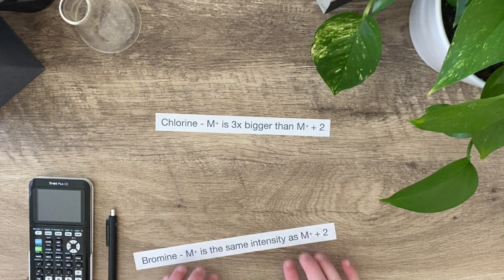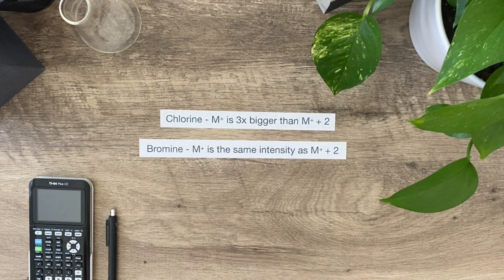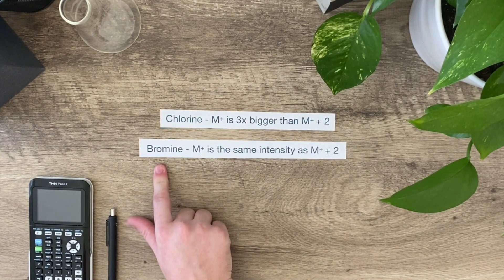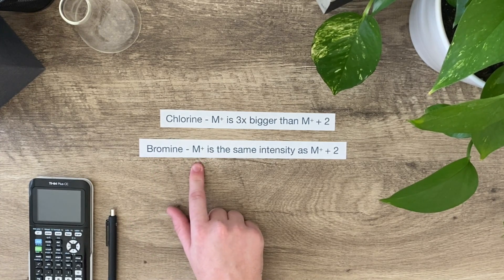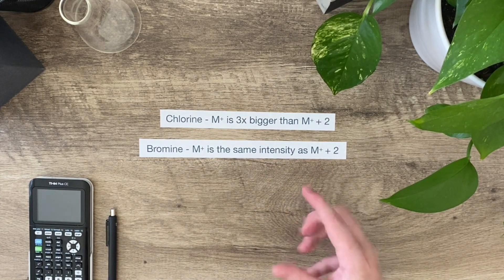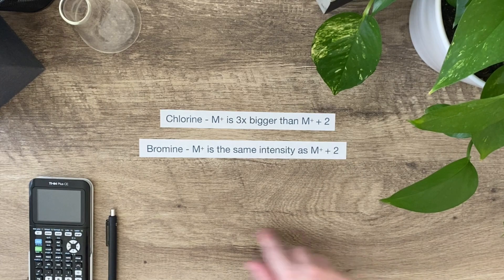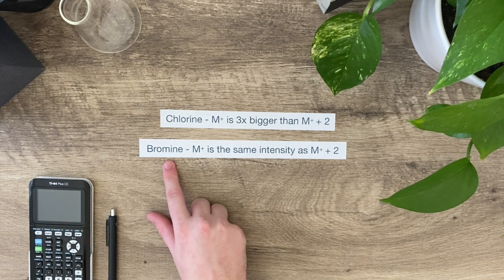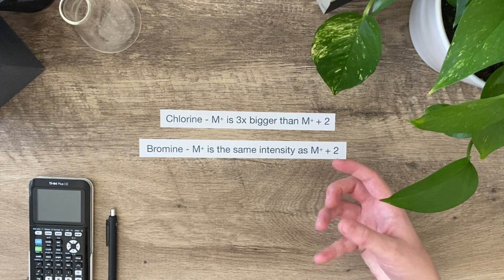The other one that we can look at is bromine. Bromine has two isotopes that are relatively equal in abundance, which is why if you look at a bromine molecule, the M+ peak is identically in size or the same size as the M+2 peak. That's because the bromine isotopes are roughly the same in abundance, and that shows presence of a bromine.